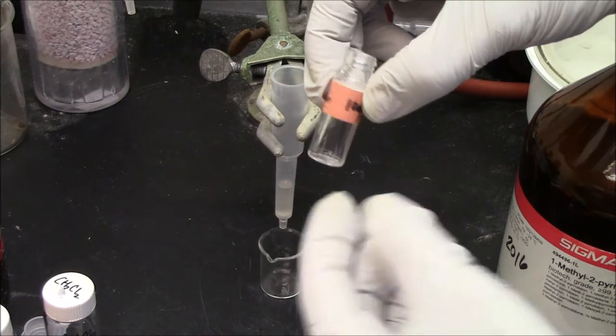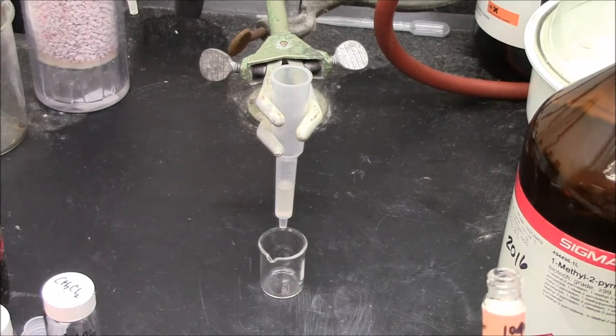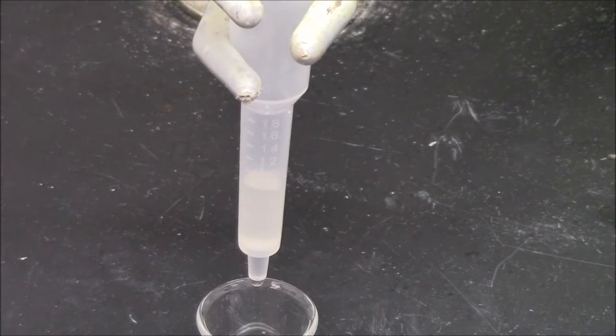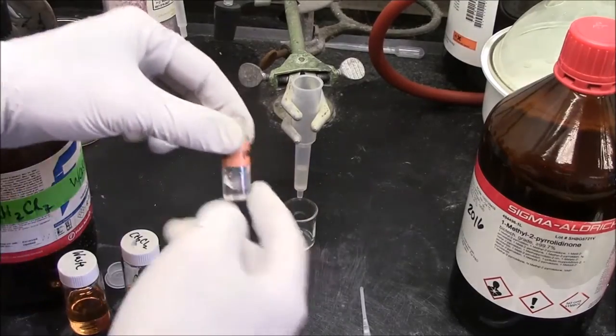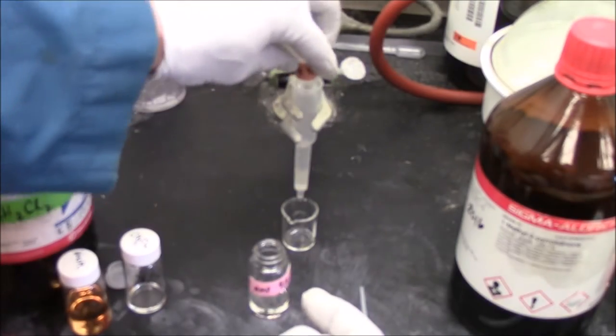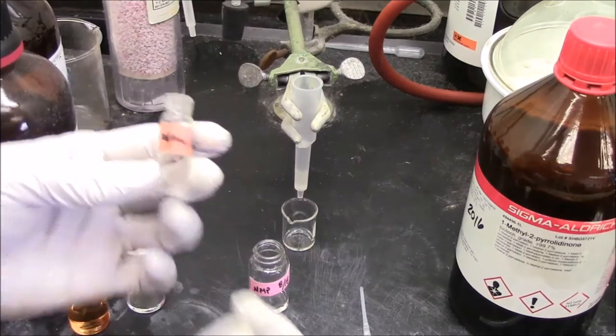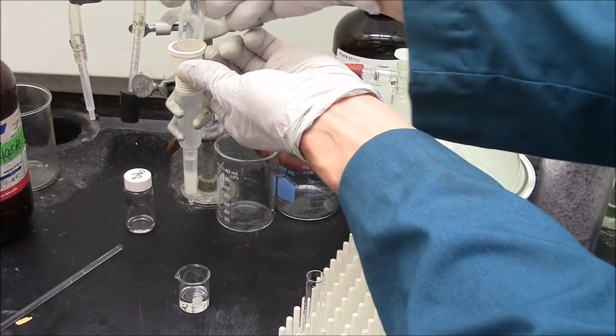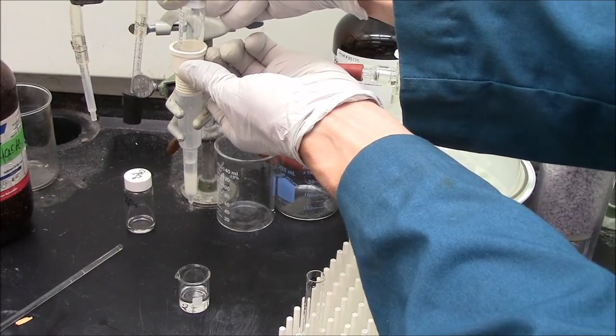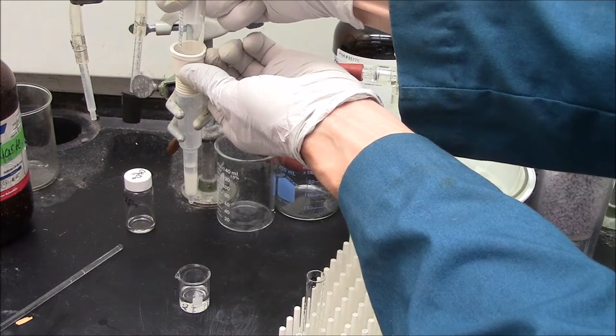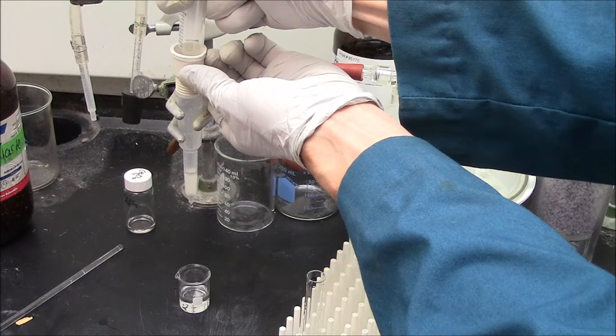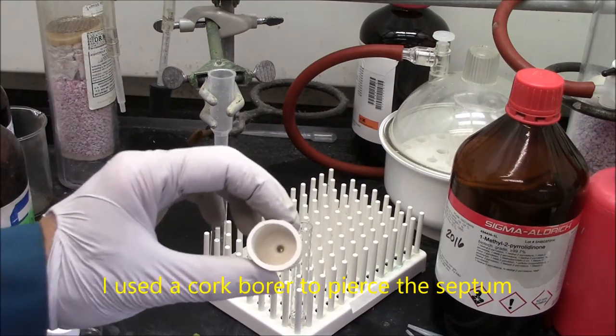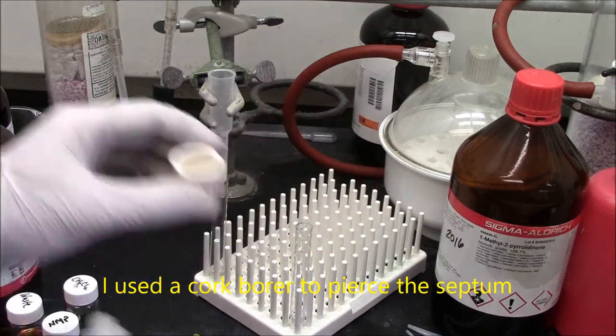I'll then rinse the vial with some NMP to transfer more beads. Here, the solvent is slowly dripping through. I've added a milliliter of NMP to the vial, and I'll dump that in as well. I'm using a 10 ml syringe and a septum to apply gentle pressure to the beads, forcing the solvent out of the column. A septum that I've drilled a hole in there, and I'll put that on top.